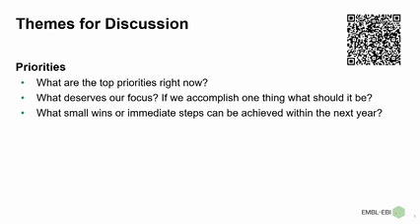And I think there's probably more than 24 different pipelines that have been developed. We mentioned the 3 or 4 most popular, but then, probably if we did a review in this room, we'd find another dozen that other people are using or even writing themselves. But if we could get people to agree that this is a format and this is the information that their pipeline should capture, then it should just be 1 click, 1 minute upload. And I think that should be a major priority. Yeah, that's a great point, and actually something that the Metabolomics Hub will try to help with.